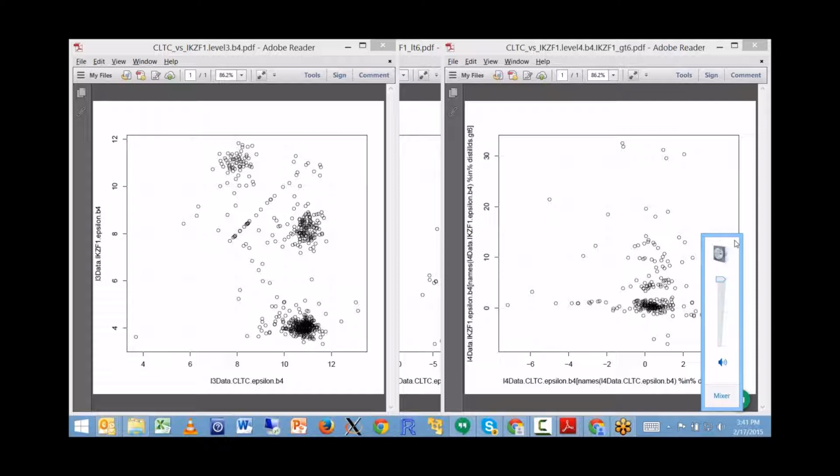I still think it's worthwhile thinking about what we're going to do for benchmarking, or what additional things we can do for benchmarking, and that's another topic. Benchmarking can come in different shapes and forms. One is benchmarking of the whole signatures: do we connect the signatures that need to be connected? The other is benchmarking at the gene level: which genes are reliably measured and which were not.